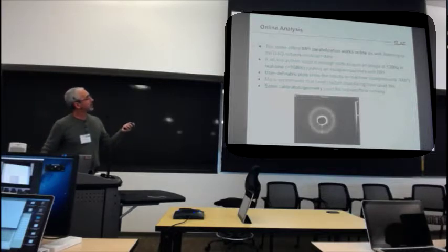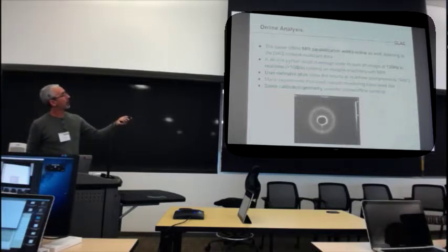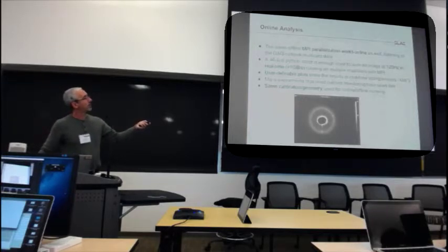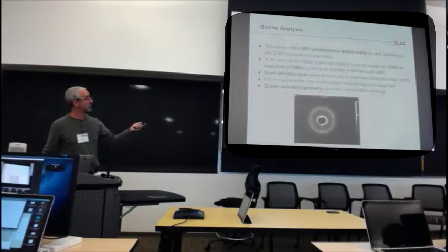All right, online analysis. The same MPI parallelization works. You launch on multiple nodes that are signed up for the multicast groups. And now we're getting into the 46-line Python script, which we're going to run. You can use it to sum an image, for example, although people are doing FFTs and stuff like that at 120 hertz in real time, running on multiple machines with MPI. And in Psana, if your monitoring doesn't fit into the default online monitoring, you can write your own. We've got user-definable plots, which you'll see.